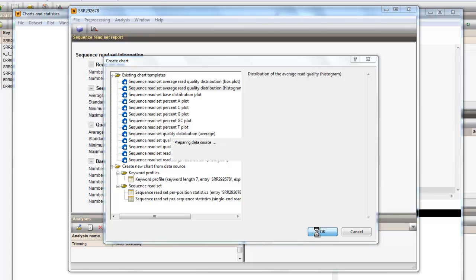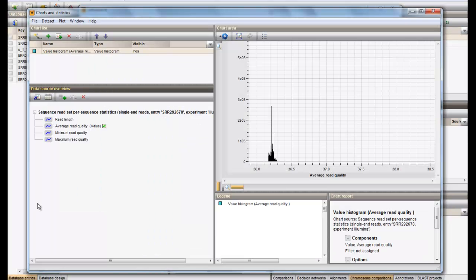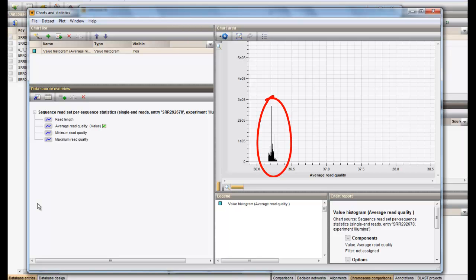This launches the charts and statistics window, where the quality distribution is plotted. From this figure, we can easily see that the bulk of the reads has an average read quality of about 36.2.